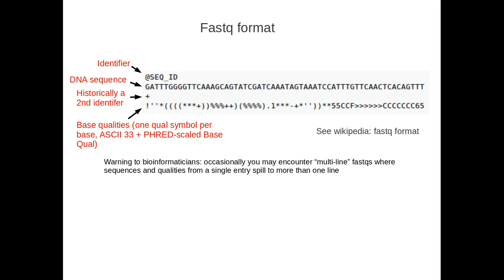So all of the software that uses the FASTQ formatted files, remember, has no way of connecting the reads from file 1 and file 2 based on sequence identifier. It's simply using the order of those reads, which the pipeline that processes the sequencing data and exports FASTQs must get right.